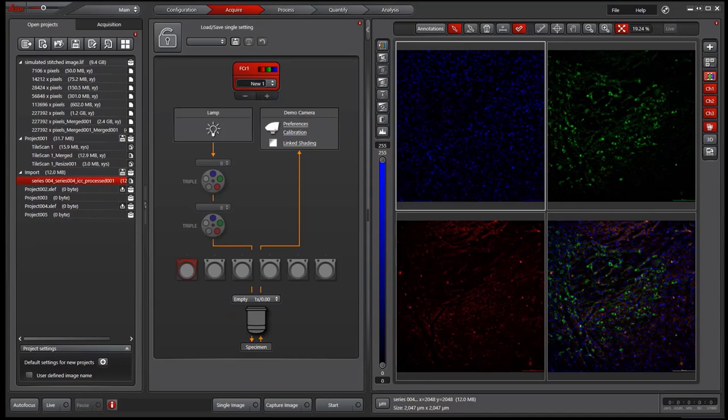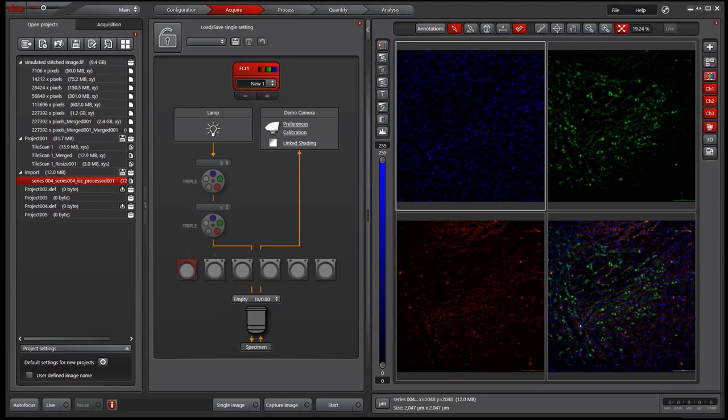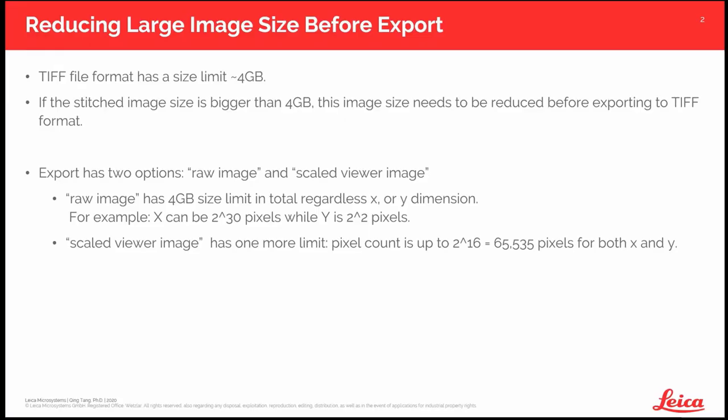Another thing is what do you do with those stitched big images next? You can review on this imaging computer or install a copy of the LAS offline software on another PC to review them. Or if you use Fiji or other third-party software to analyze the images, double check if they can open LIF file directly. I know for sure Fiji and ImageJ can.